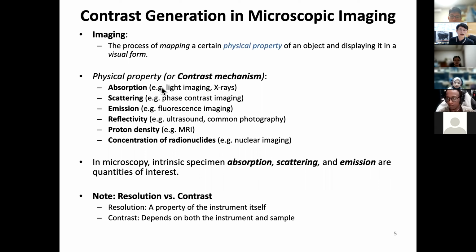Another thing is generalized imaging. For example, what you are seeing of me is room light hitting every point of my body, and then it scatters. Then it gets into the detector, and that is the electronic image you are seeing right now. So that is light scattering, which we already know about. A little more advanced topic, which we will cover later, is fluorescence imaging.